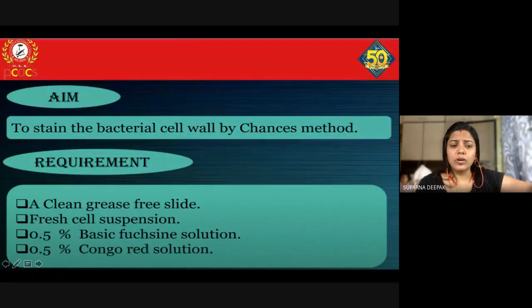Let me explain that. Say this is my slide. On this slide I'll place one drop of oil, and then when the objective of the microscope comes down like this, the objective lens will be just touching the oil. Here is the smear, which means the organisms are present in this area, and on that you are putting the oil. So there is a connection.